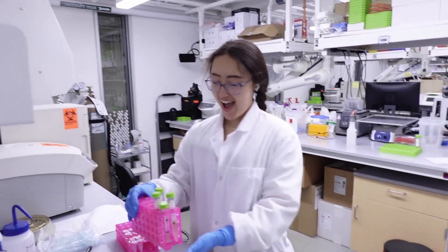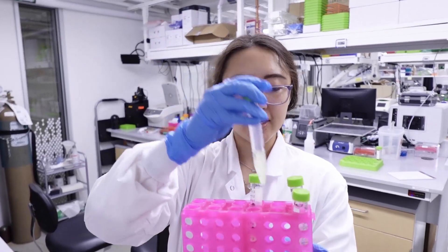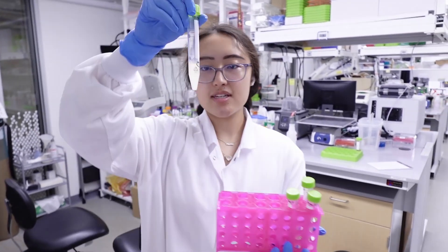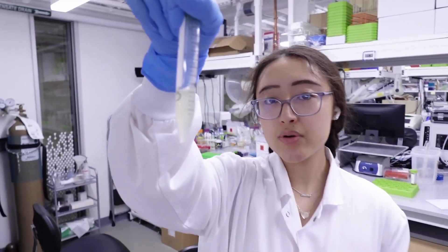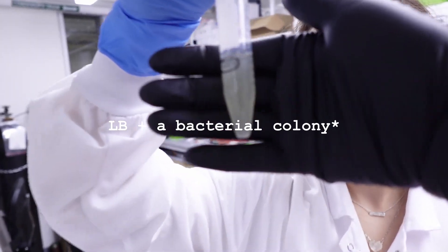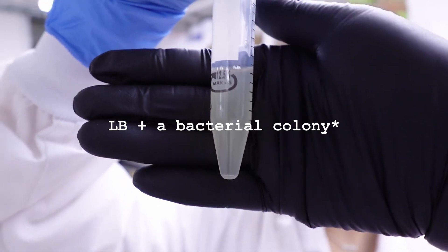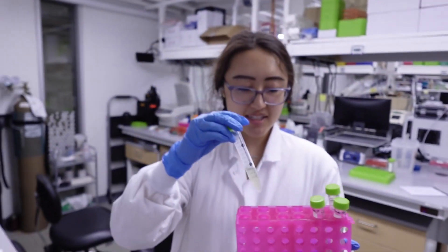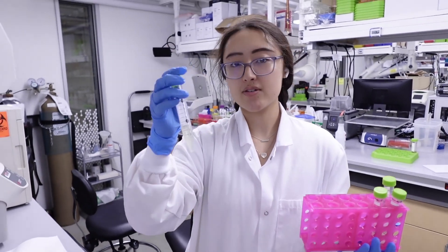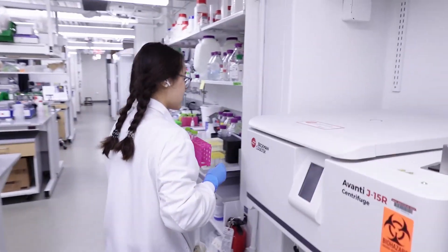So what is the first step that we're going to do? So first, this is our inoculated bacteria. And as you can see, it's a pretty cloudy mixture. So it's Luria broth or LB with our DNA. Basically, what we want to do is just get the cells out without all the extra liquid. So the first thing we're going to do is we're going to centrifuge it.